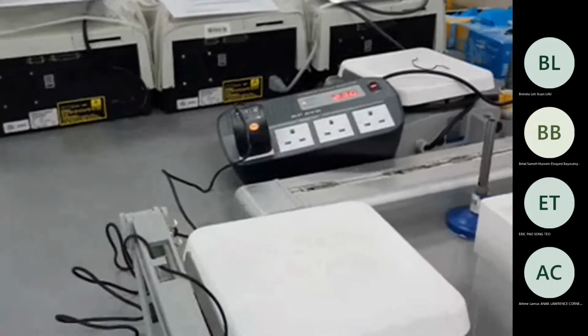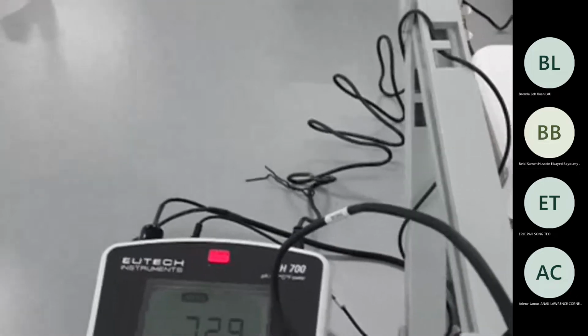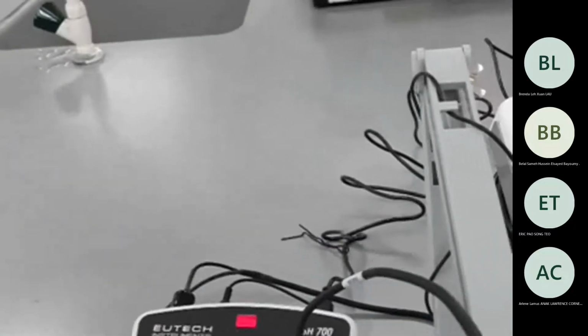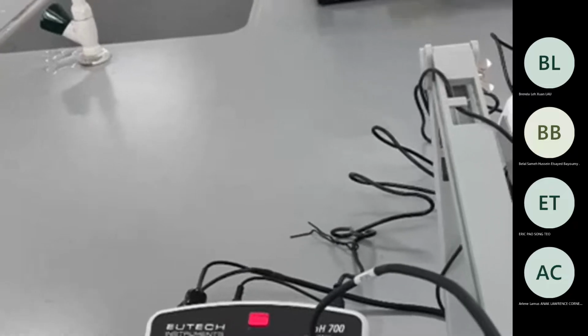Yeah, no, it's 80. Yeah, it's 100 ml. But the thing is, these beakers are not very accurate. Even if it is 100, we cannot say that it is exactly 100, because it is not accurate. It is written on the beaker, as you can see, as an approximate value, and they don't even mention what the tolerance, plus or minus, is. They don't say on the beaker. Whereas you can see on the pipette or burette, it is written accurately, plus or minus 0.05 milliliter. So it is very accurate.